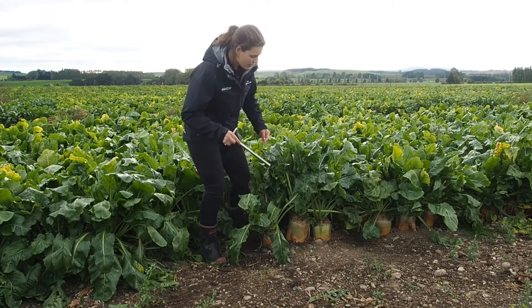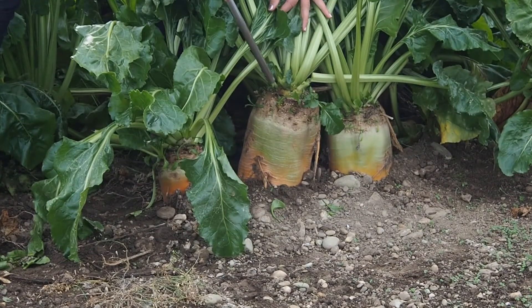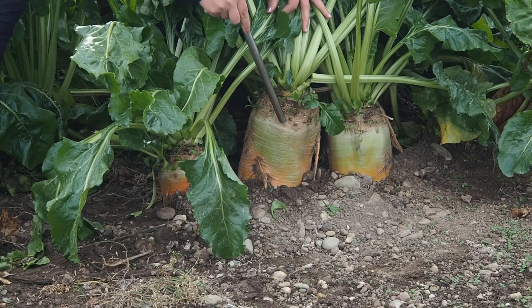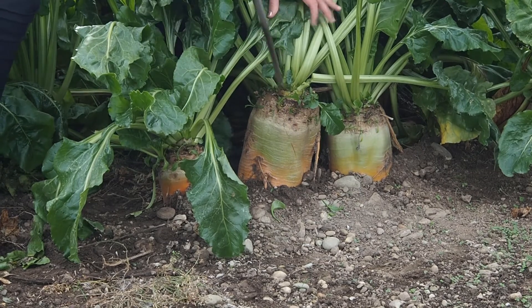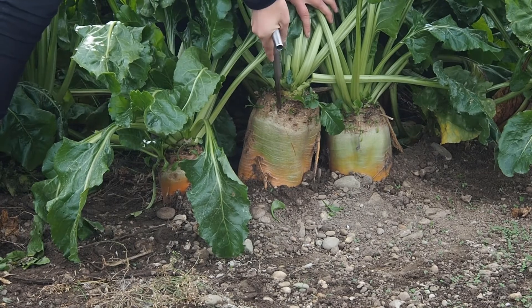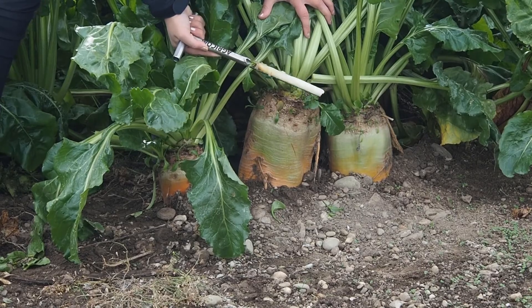If we zoom in here, you want to put the corer in the top shoulder of the bulb and go at a cross-section through the bulb in that direction. It's all in one motion — put the core into the bulb, get the leaf out of the way, twist as you're moving down, and then twist as you're moving up, and there's your core.